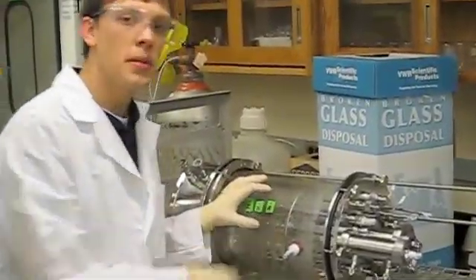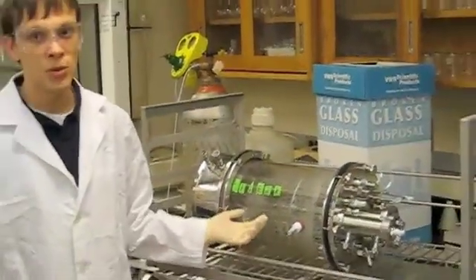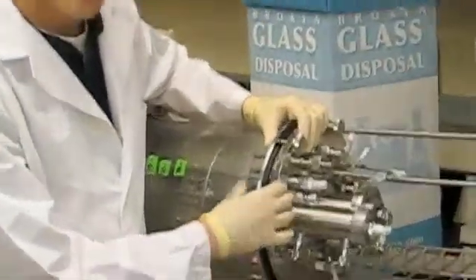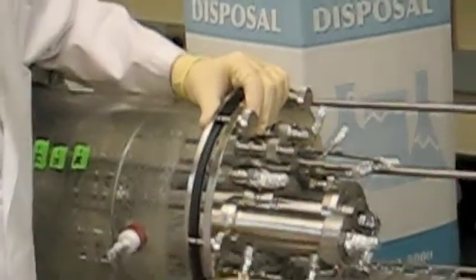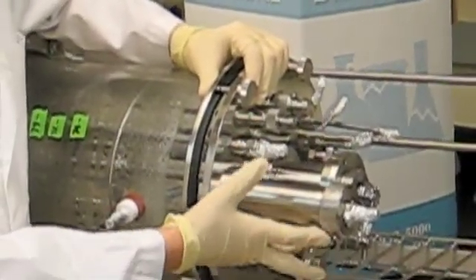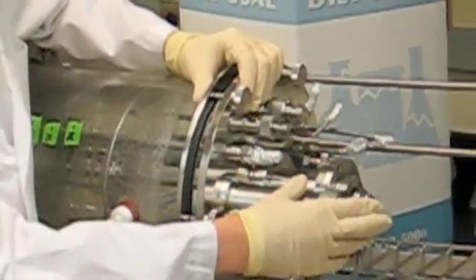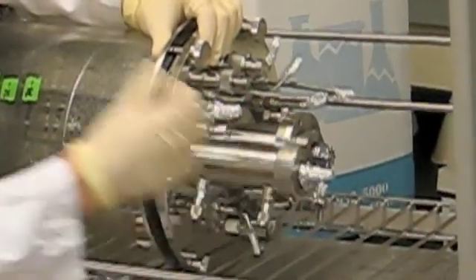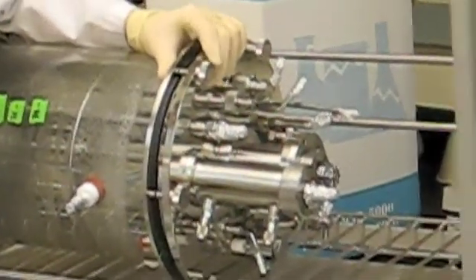So the glass part is the main area where fermentation will be carried out. Up top, in our lid, you can see our condenser, and we have a water in and water out for our condenser, and then our gases will be exhausted through this port, which is going to be connected through tubing to our fume hood.